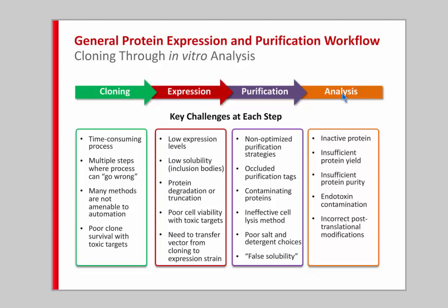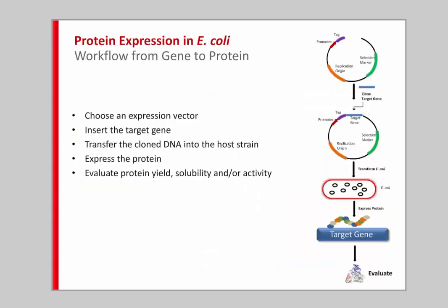And there are enough potential challenges listed here to spend an entire day talking about them, but for today's presentation, we're really just focusing on the first 2 steps, cloning and expression in E. coli. So let's talk a little bit more about those steps. So our cloning step starts with choosing an appropriate expression vector.